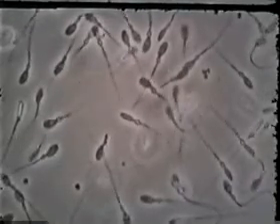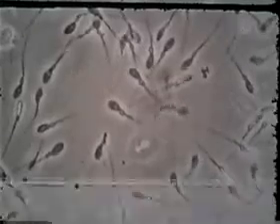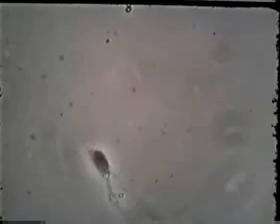A variety of swimming movements are evident in this segment. Note the forward movement shown by one sperm in this preparation. Notice also that a few sperm are showing a slow circular form of movement. In these individuals, there is a distinct curve in the region of the midpiece. The flagellum in motion appears somewhat more linear. But even so, the majority still show the tight circular movement that is so characteristic of the preceding segment.